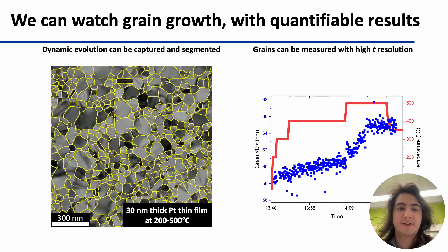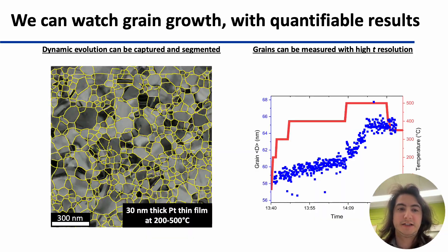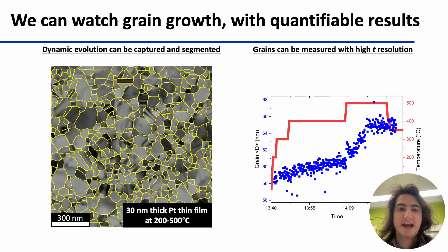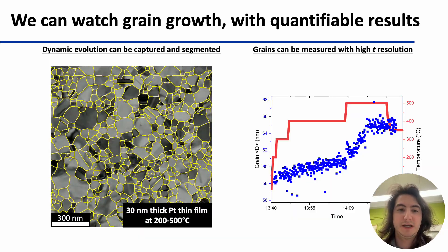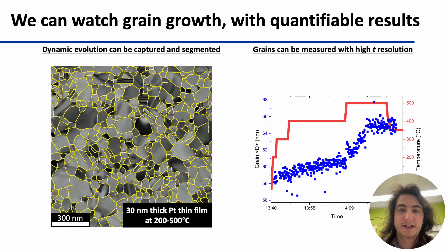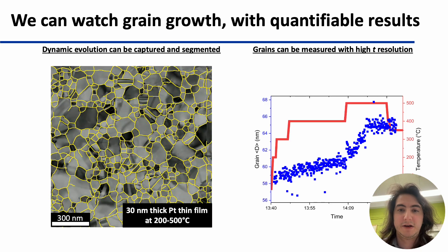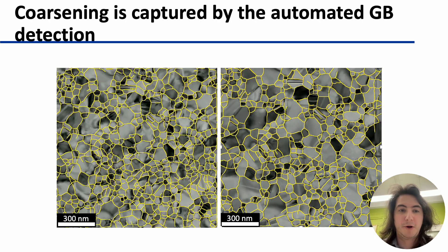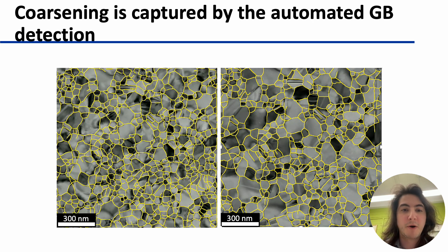On the left you can see micrographs collected during an in-situ heating experiment over the course of about 40 minutes, and as you watch you'll see the grains coarsen. This corresponds to the increasing grain size you see in this plot here, as well as the increasing temperature. You can see very clearly that coarsening is captured by this grain boundary detection algorithm.